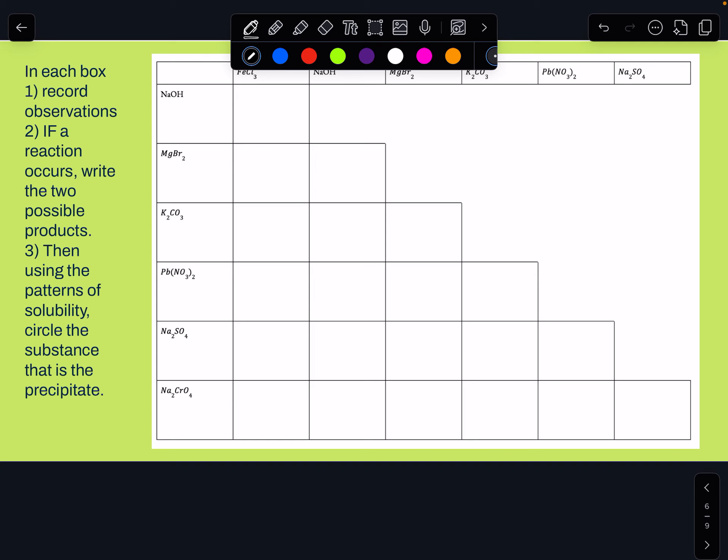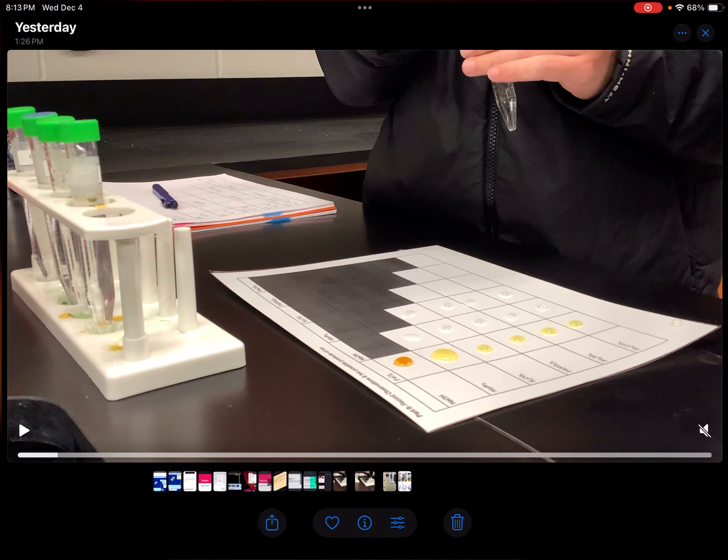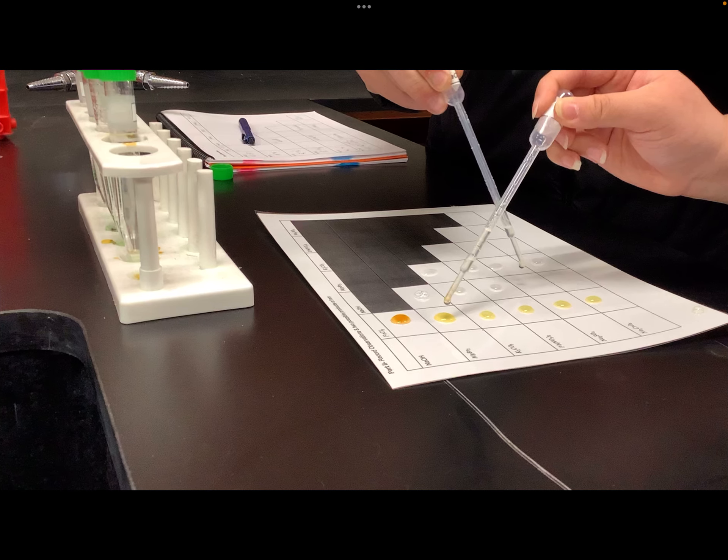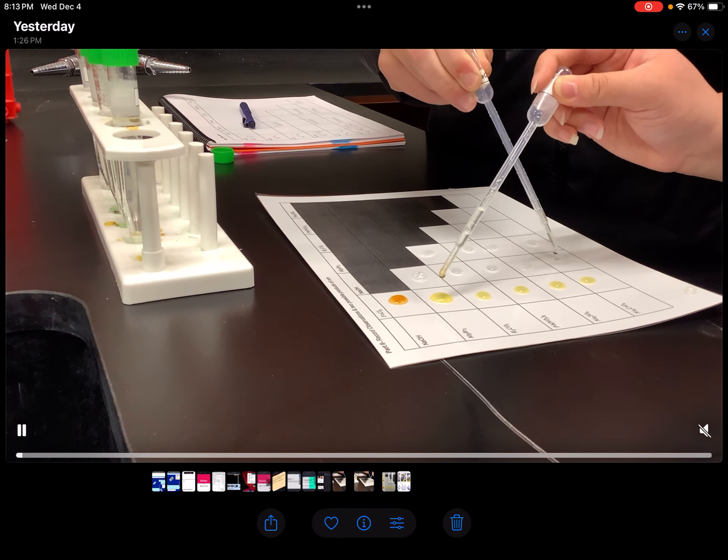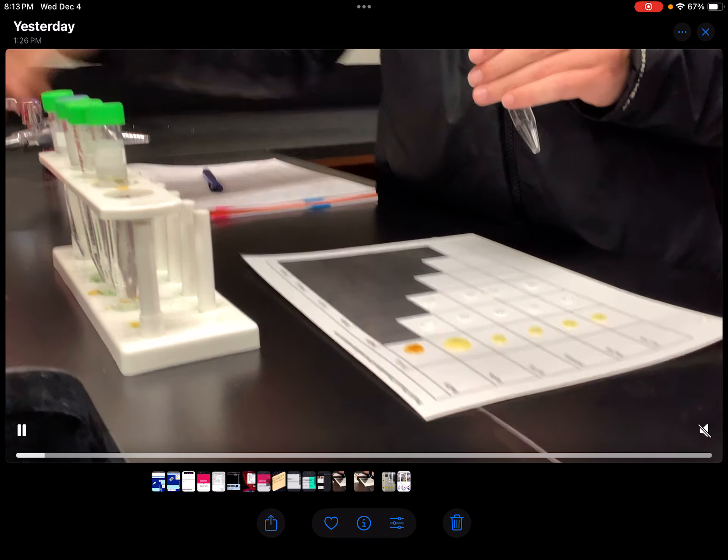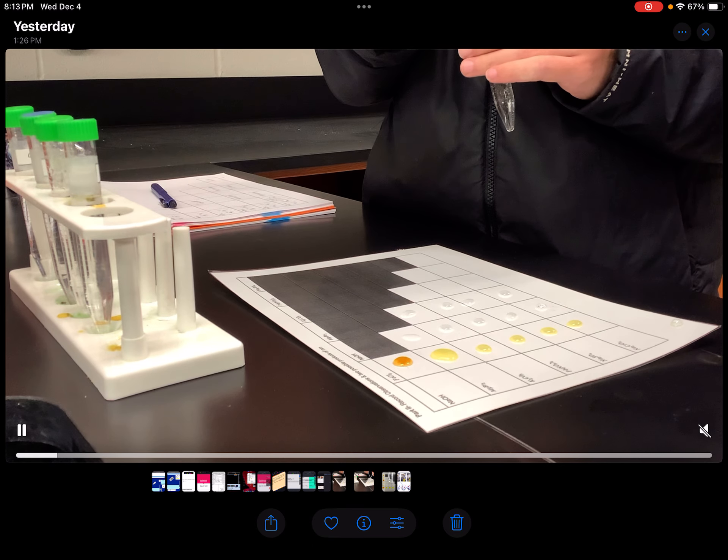What you'll do is in each of these boxes, the first thing you'll do is record your observations. You'll see what happens when they drop the two things together and record what happens. Sometimes nothing will happen and so your observations will be no reaction occurs. Let me go to the video and watch a little bit. The first box they actually have already mixed them. If you watch right here you'll see them start adding the other two, so it's kind of like a grid system and the two things are mixed together in the square.